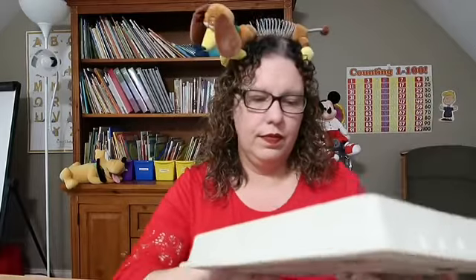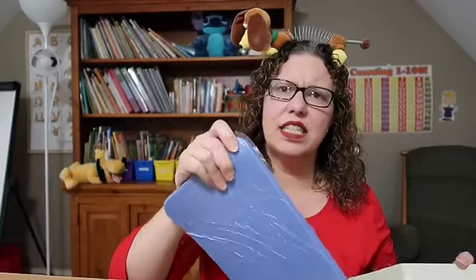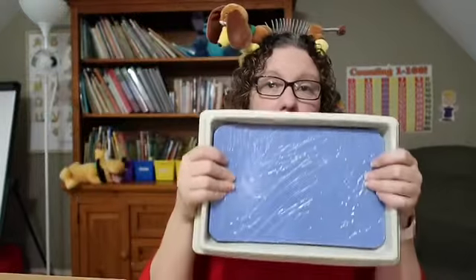The inventory lists a dissecting pan and flex pad, which is this next part coming out of the box. The pan is pretty big. It has a little note inside that says plastic pans are not designed for use with black wax, and do not put the pan in the oven. It does not say 'do not attempt to cook the specimens' — I added that because I can't imagine why you would put the pan in the oven. It also says use Dissecto Flex pads only, which is this thick, heavy, spongy material that was inside the tray.